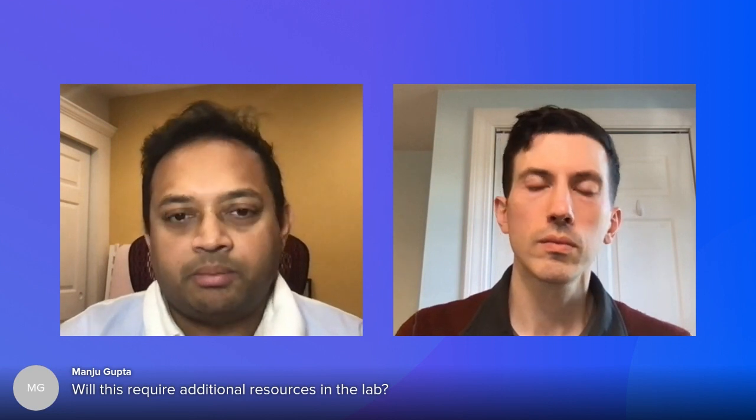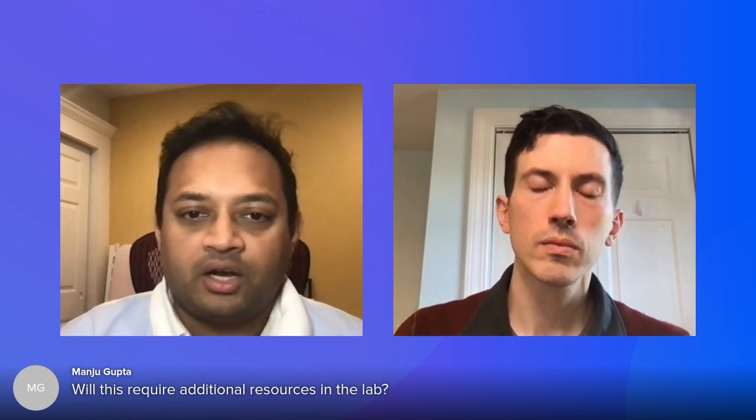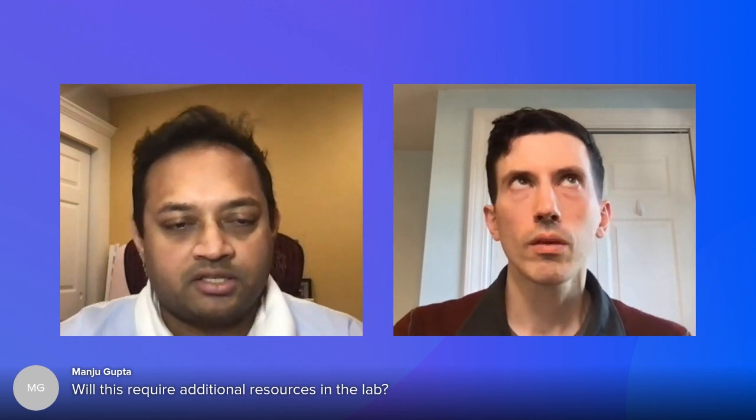Will this require additional resources in the lab? I think this question is fairly open-ended, but if I understand, maybe Tom, we can comment on what aspects of Benchling require, maybe, an admin to manage the Benchling software. Yeah, if you can just talk about some admin roles versus user roles, I think that can answer this question.